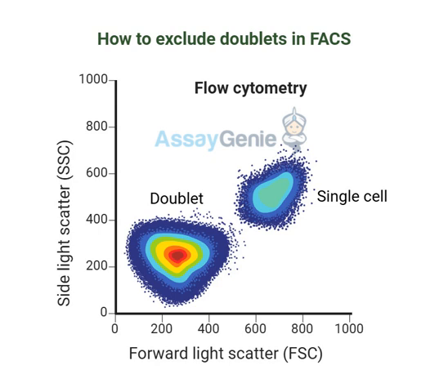Getting the cell analysis right is crucial for making sure we make the right choices about treatment and aren't misled by these doublets. That's a pretty sobering thought. It really makes you see the importance of all of this. It's not just about some numbers on a graph. It's about real people's lives.